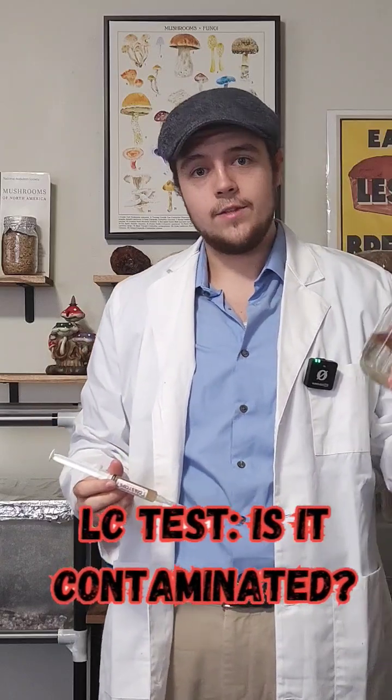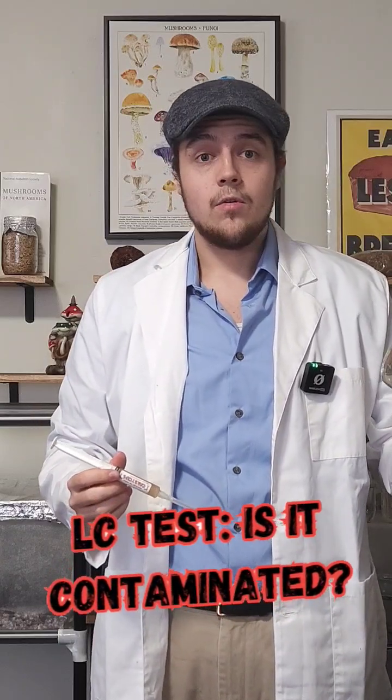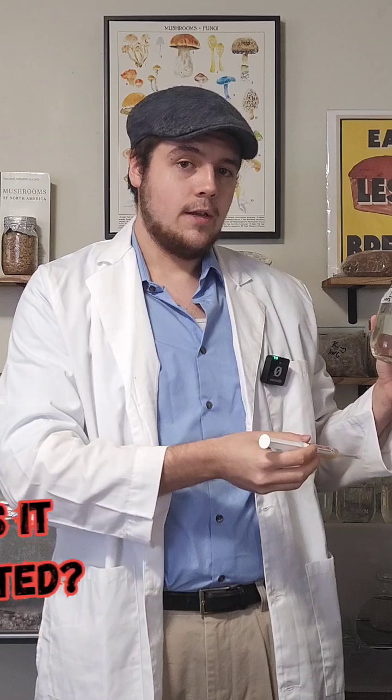Hi guys and welcome back to the Fungi Files. In today's video we're going to identify some previously inoculated cordyceps liquid culture, and I'll show you what I've identified that makes me believe that it's contaminated.